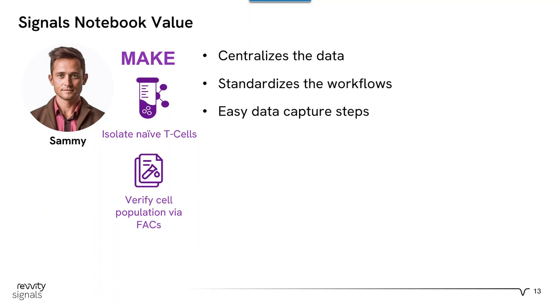And as you have heard me say, for those of you who are familiar with FACS analysis, the yes/no answer is extremely insufficient for screening drug candidates. We need to see curves, we need to see much more detailed information, and it's more sophisticated. So don't worry, in the next scene, we will show this.